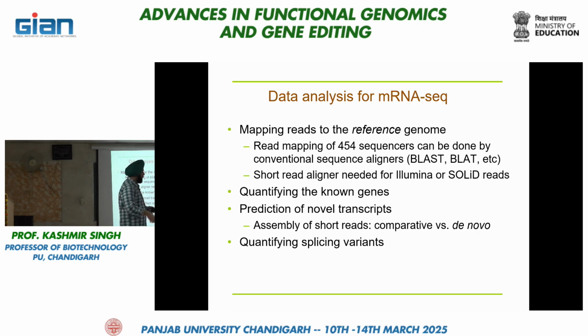So that's very easy. Suppose this is your reference genome and you have short reads generated, they will automatically go to the location where they are matching. Okay, and everything is very clear. But what is de novo? That you throw your data and they will align automatically without any reference genome. So that's a little bit tough task. That will align on the basis of the similarity at the ends. Okay. So that will be challenging, the overlapping might be just by chance if you have not given very stringent parameters, and you might have problems in analyzing the results.